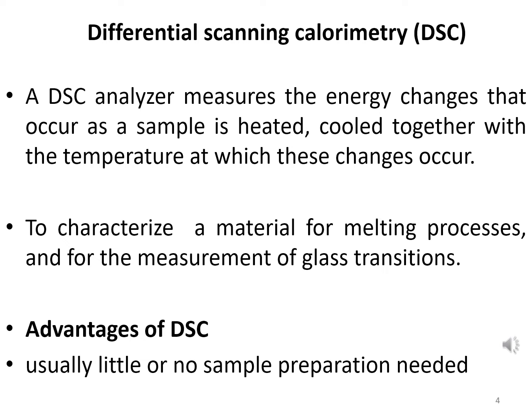So actually DSC analyzers can measure the energy changes that may occur if a sample is heated or cooled, or if it is held isothermally, as a function of the temperature at which changes may occur.